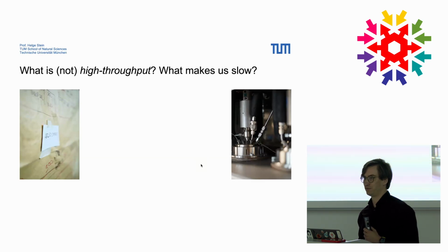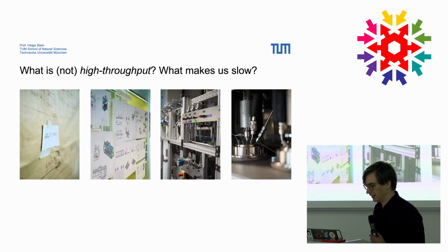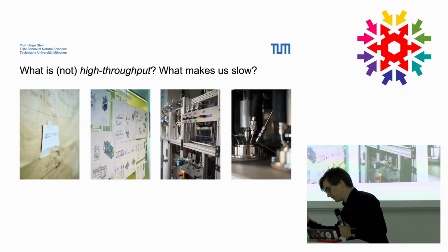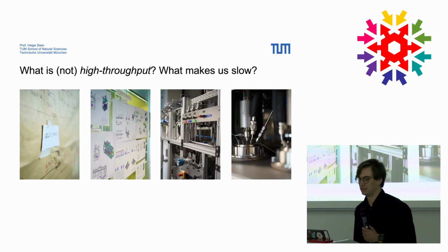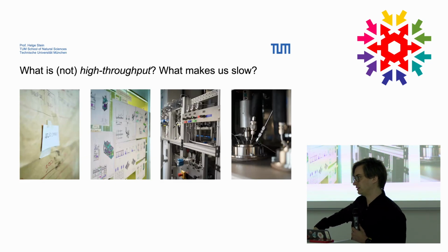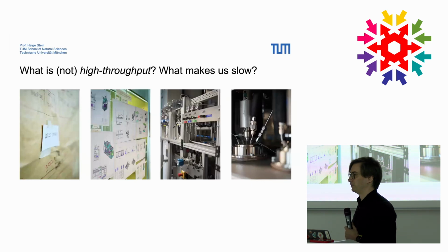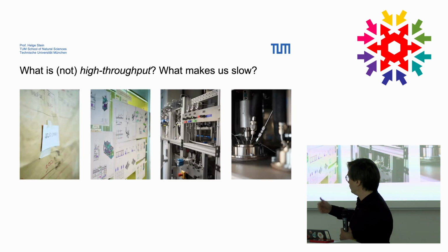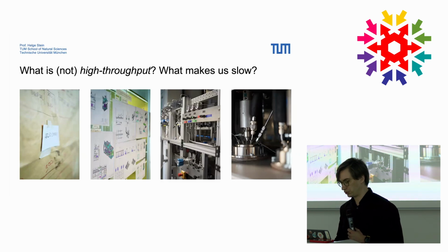So is this high throughput? I don't know, you tell me. What I think is more important than thinking about how fast we are, is everything going to be in 1 second, is that you set up your instrumentation and your software backend in a very agile manner. Meaning that if tomorrow somebody comes and says, hey, I no longer want to build non-aqueous batteries, I want to build aqueous batteries, you're not going to say, oh, we can't do this, but you can adapt to new kinds of experiments and adapt to new parameters more quickly. And then if you have this standardized, I think you can start to call yourself high throughput, even though you might not have automated 100%.